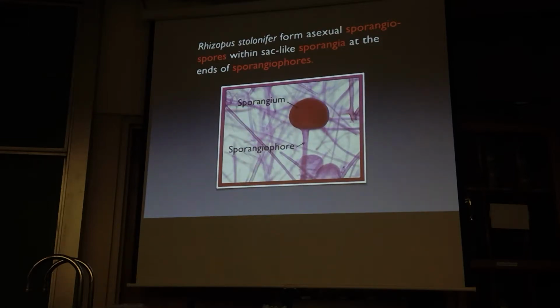These are the asexual spores. Again, they're in a sac. In this case, the sac is round. So if they're in a sac and they're asexual spores, they're sporangiospores. The nice part about our Rhizopus slides is usually both types of spores are the same color. But again, this is totally artificial. We have some slides where the Rhizopus is stained green.